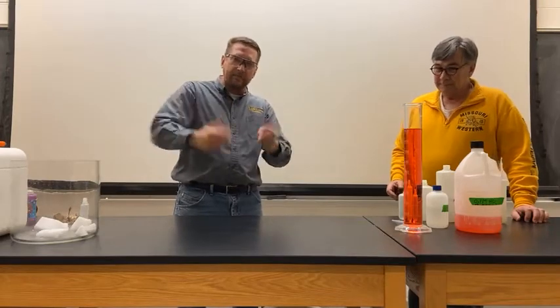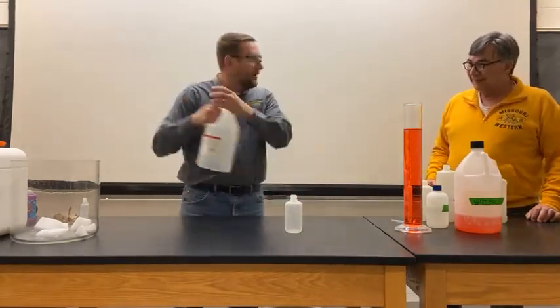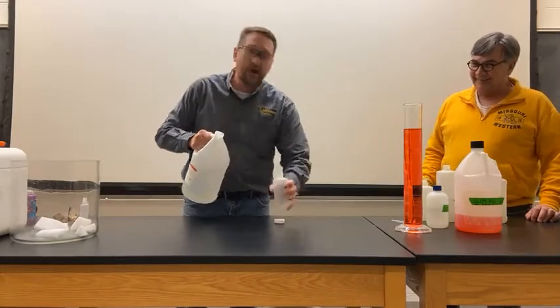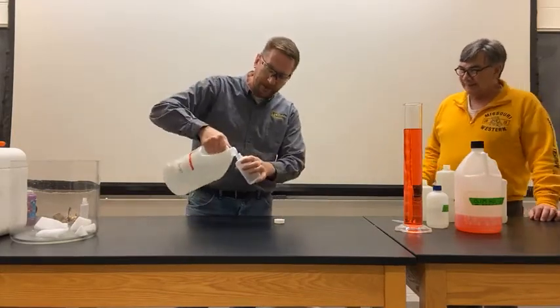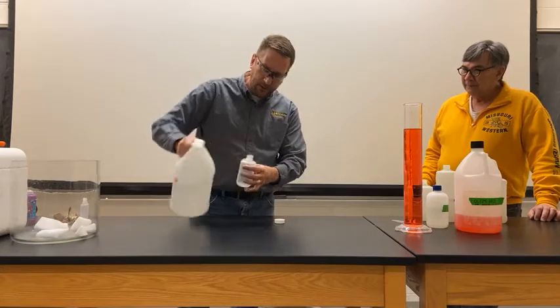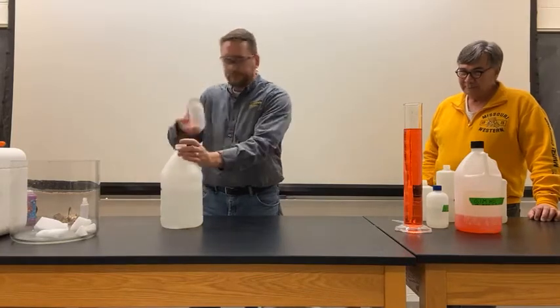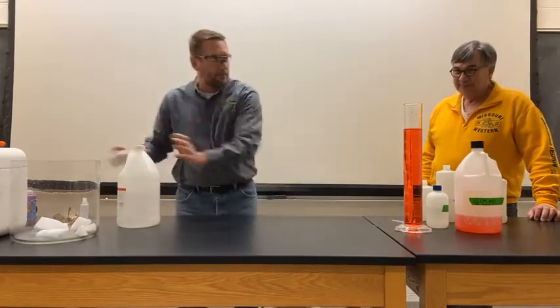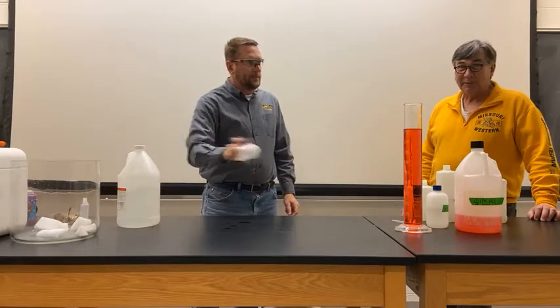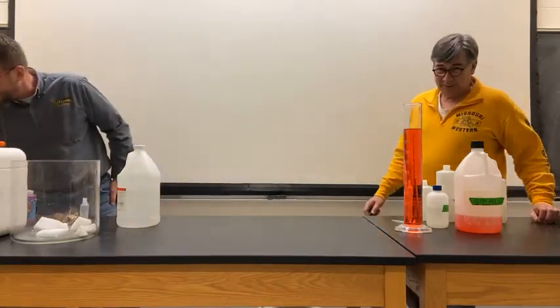Now, we could stop there, but this is chemistry demonstration stuff, so we're going to have a little bit of fun with this while we go, okay? So we call this edutainment at this point, right? You already got educated, now we're just playing. So I'm going to put a little bit more ethanol, but we're going to go to a bigger bottle this time. So I had a little bit larger one there. What do you think's going to happen this time? Yeah. More ethanol.